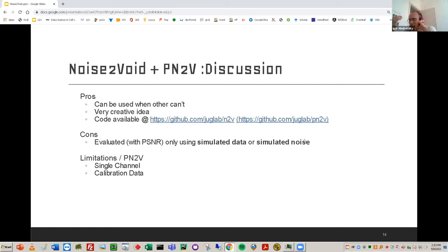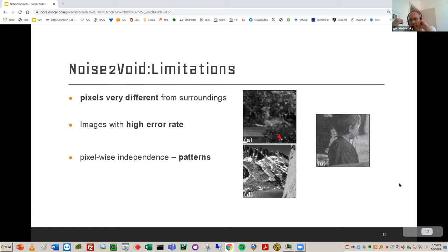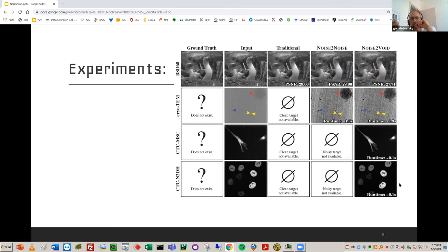Okay, so I tried to say something a few minutes ago, but you probably didn't hear me. I want to add something. As I showed in one of our slides, measurements in the first article are only visual. The last three lines, as you can see, are all captured with microscopes, so you can compare only visually. There are no measurements because they don't have any reference. You understand, Lior? It's an answer for your question. All the images captured with the microscope are blurry or noisy, and you don't have any clear reference, so you can compare only visually.